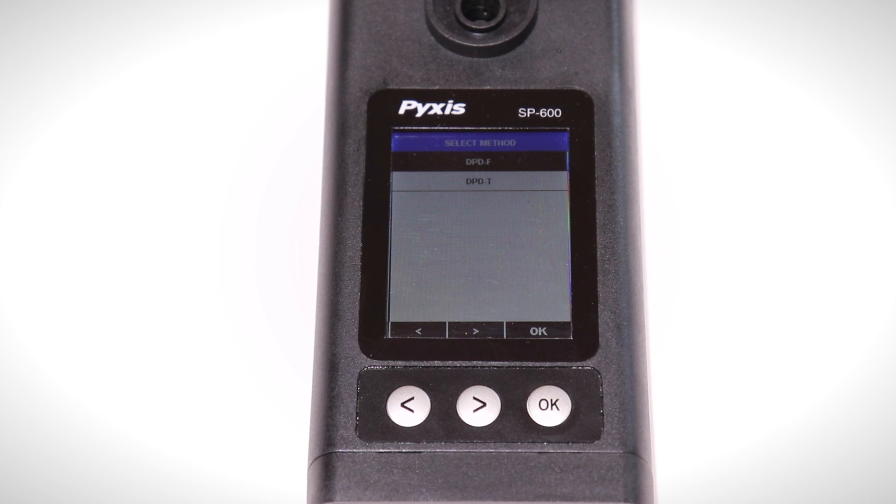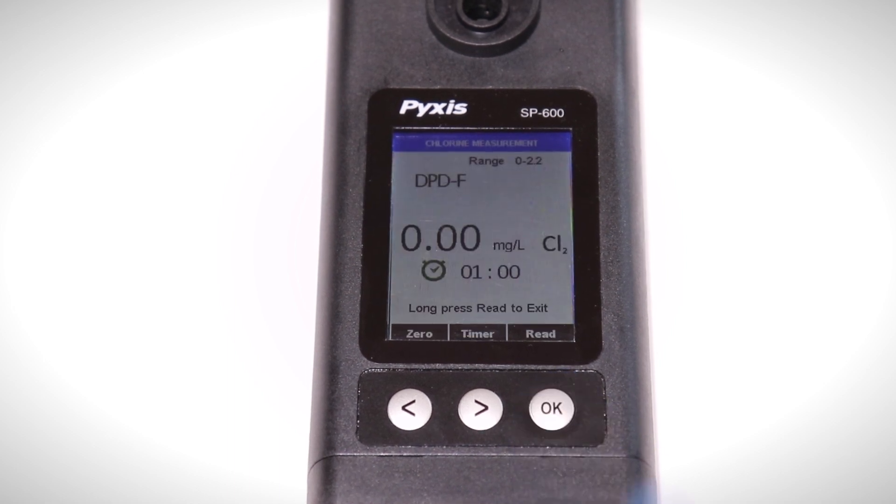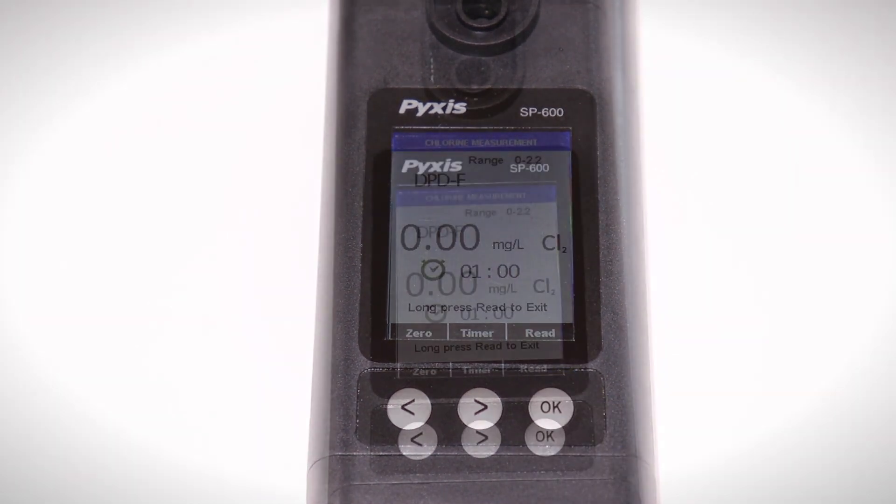Both test procedures have an identical process and are pre-programmed with specific timers. For this video we will conduct the DPD free chlorine test.